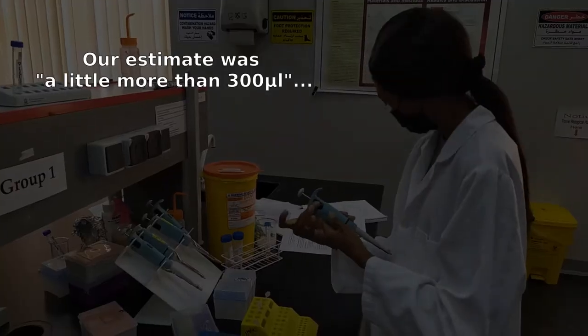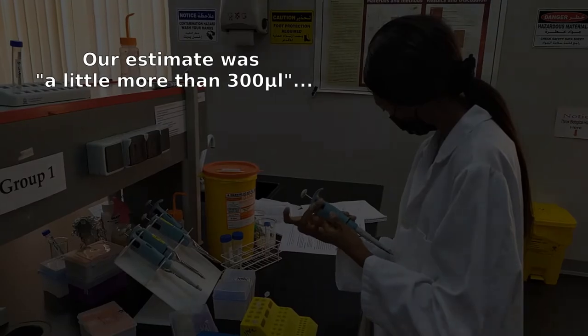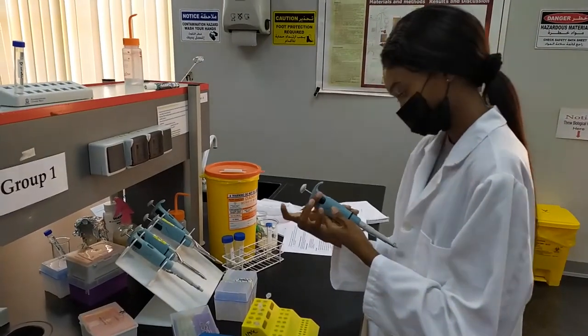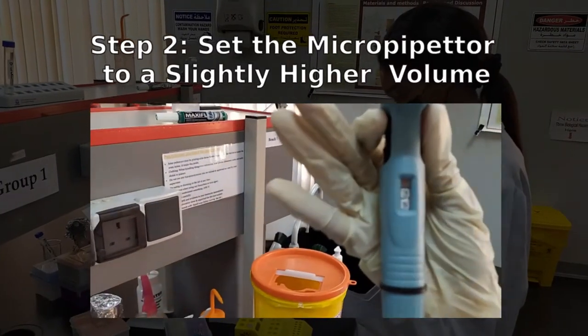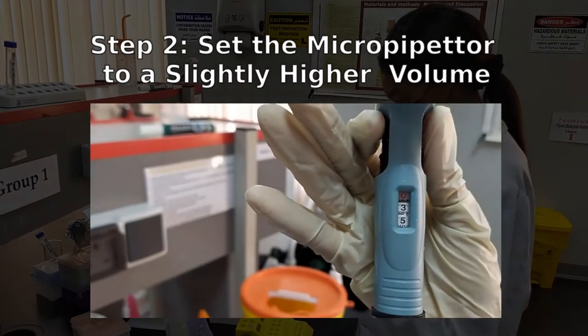Once you have this estimate, what you want to do is get a micropipetter and set it to a volume just a little bit larger, a little bit higher than the estimated volume.